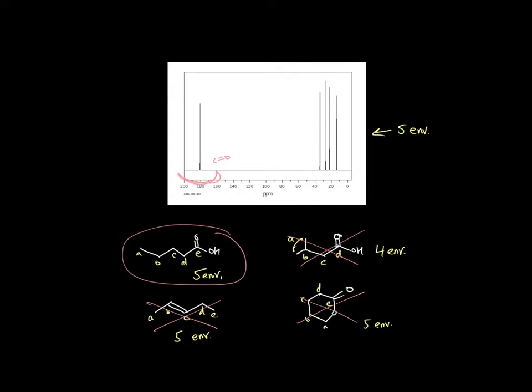So I would just consider, this is what I'm going to ask you to do, is given a spectrum to either match it to one of a possible list of molecules, or to just confirm whether or not a molecule matches to a spectrum.